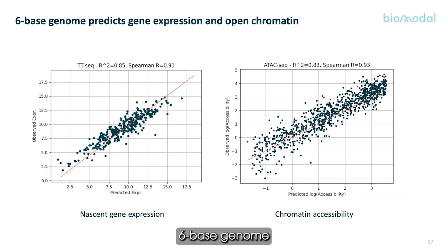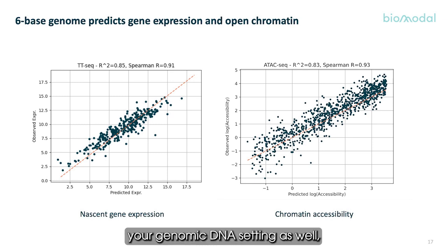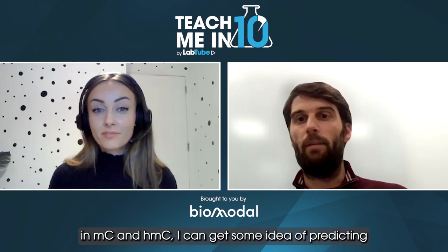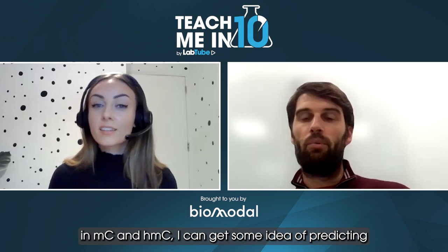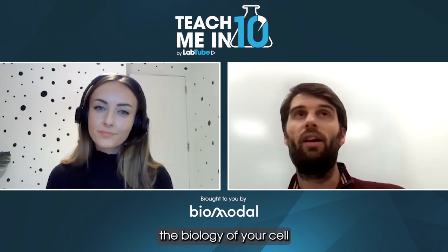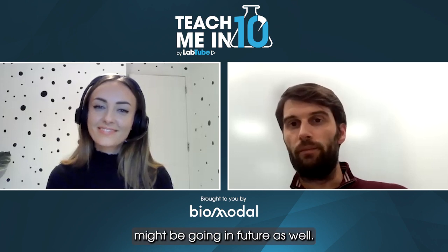So you're getting the 6-base genome with all the features I talked about previously in the liquid biopsy setting, which you can also apply to your genomic DNA setting as well. But what the models are demonstrating is the promise that you can start to get more functional readouts that go beyond simply additional features. You're starting to say, well, where there are differences in MC and HMC, I can get some idea of predicting what's happening from a gene expression perspective, from a chromatin accessibility perspective, and then you can combine that with information you might get from those enhancer measurements about predicting where the biology of your cell might be going in future as well.